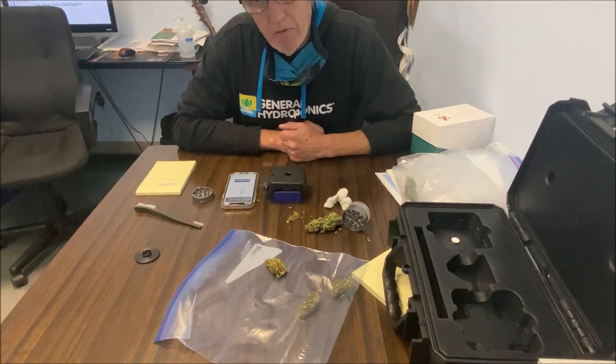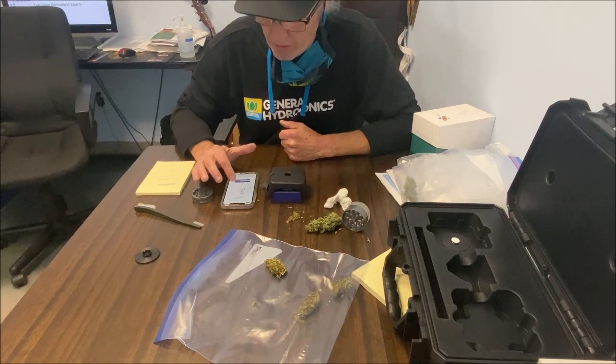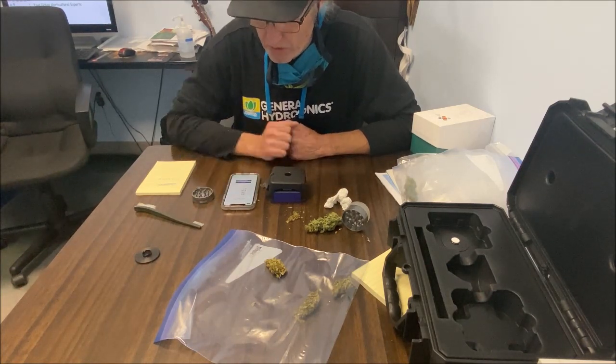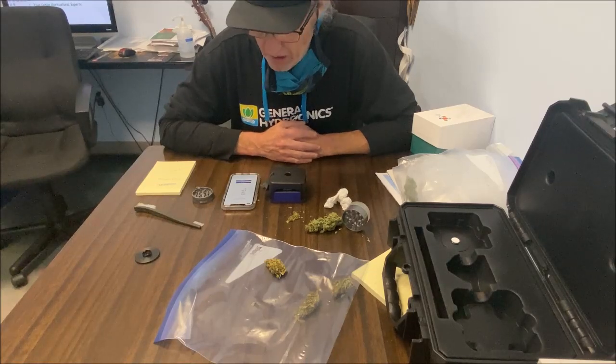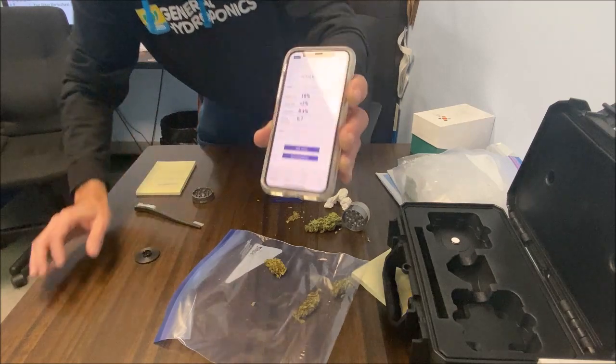So that I think is much lower. I probably had like a 20 or 30% moisture content when I tested it the first time, and I got somewhere in the neighborhood of 14. So I think having it completely cured does make a difference in your results. So 18% for Clean Chemo, I'll take that. No CBD, but 18%. So this is what the measurement looks like.